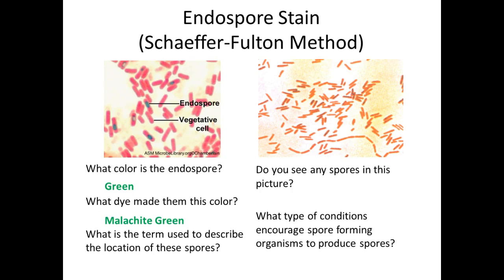So it's another reason why I have that demo slide up for you guys. Plus you'll see them when you stain them today, right? I don't know what it is about the malachite green. In the past it was like Christmas tree green. It's more blue lately. But again, it's going to be within that color range, right? Greenish, bluish color.